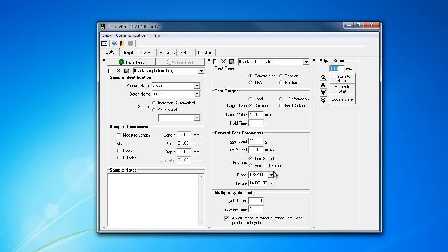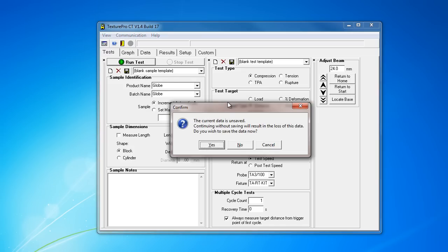I'm going to do a second test here. Settings are the same. I'm just going to move my bump probe down a couple notches here. 21, 22, 23. You've got to wait for it to do the change before you hit it again, of course. Run a test. What you'd assume here is that it would run the new test while remembering your previous test, because it's a fair assumption that doing material testing, you're going to care about what your previous results was because it's about comparing them.